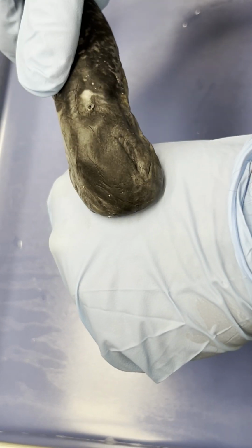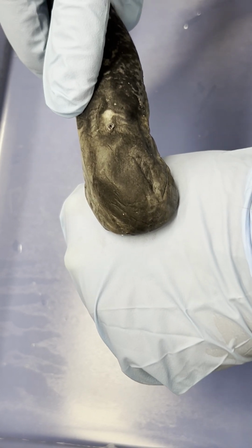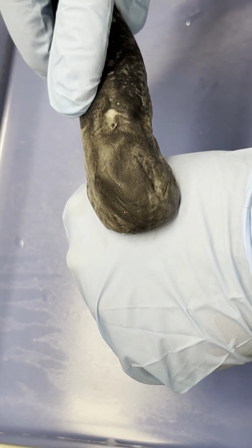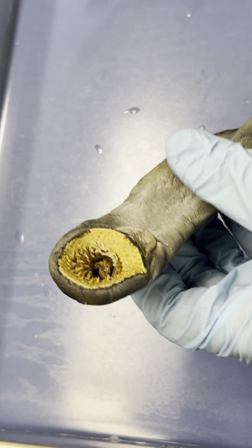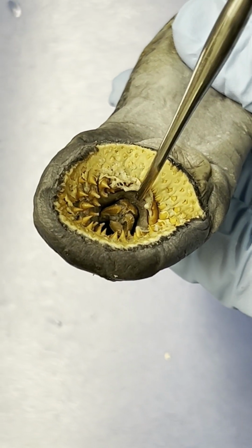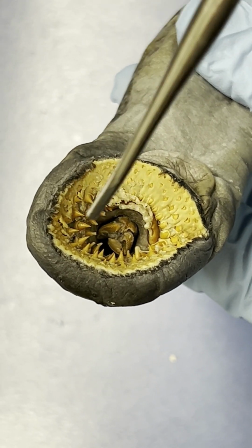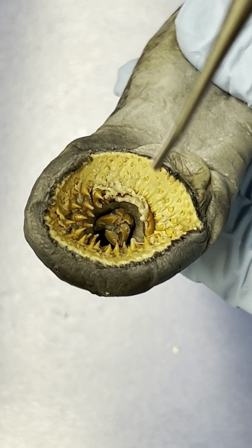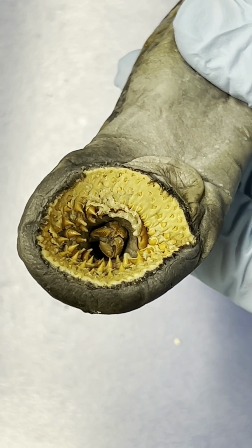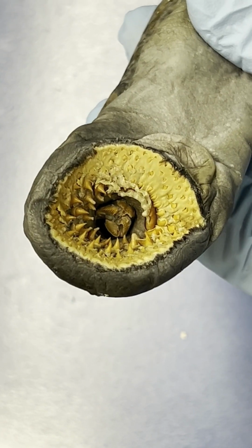Instead of my hand being a rock in this case, they're going to latch onto the back of a fish, usually where it's a little bit more meaty and some more muscles towards the back of the fish. And then they're going to use this tongue, which we'll actually get to. Maybe Maria could zoom in on this tongue right here that actually has 3 teeth on it. They'll latch onto the fish, have that tongue protrude out and start digging into its host fish and start eating that meat. And then the third type of feeding functional group of lampreys, they're bloodsuckers.